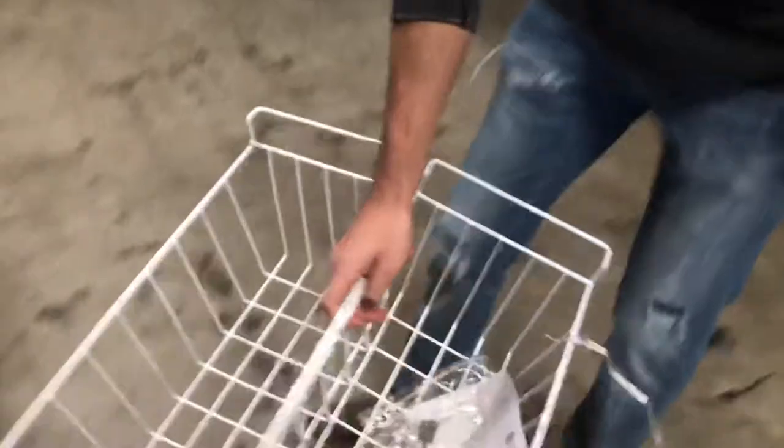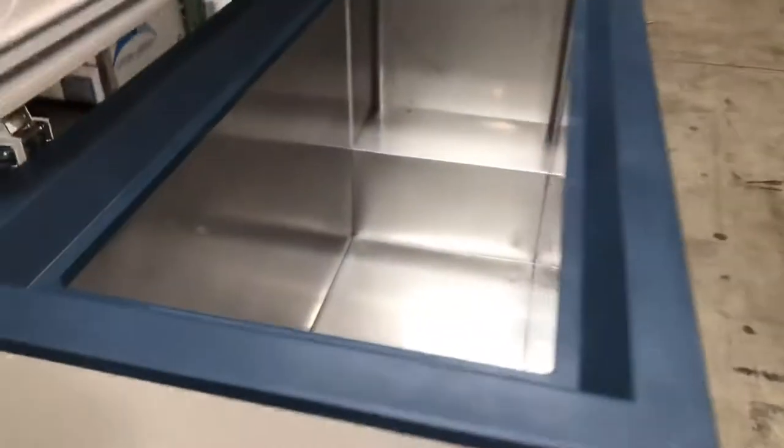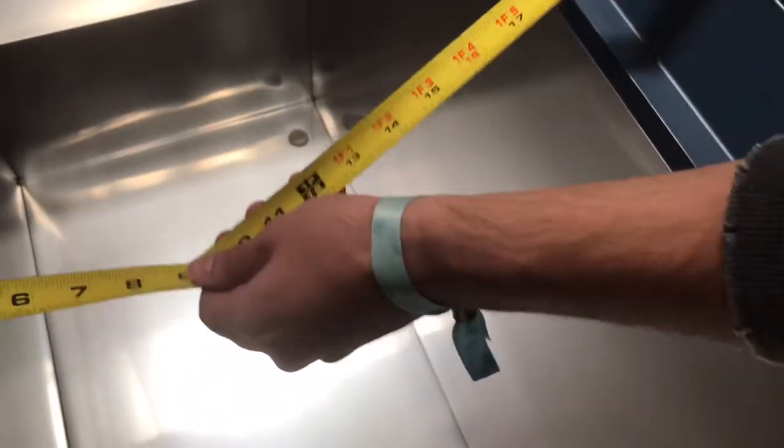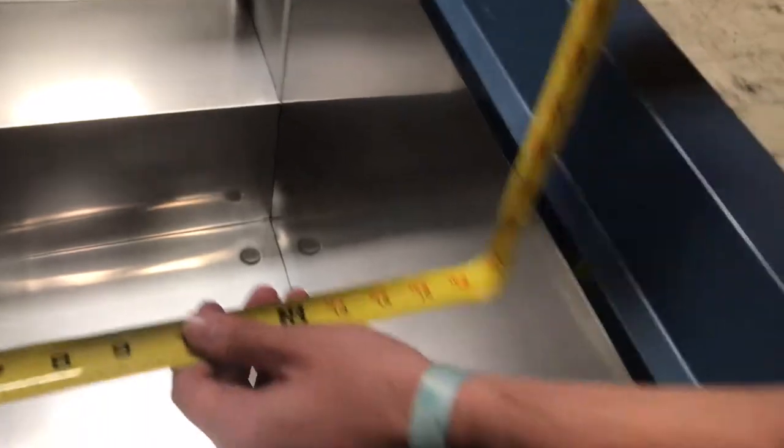Now let's give you the inside dimensions. For the length, it's going to be 47 inches. Front to back, you're going to be looking at about 18 inches. Top to bottom, it's going to be about 25 inches.